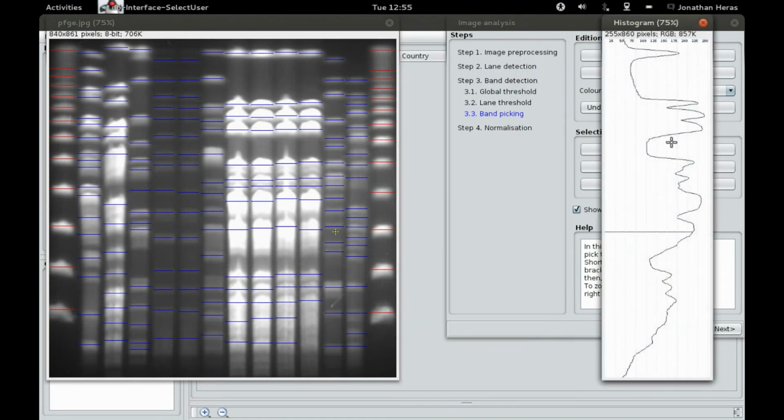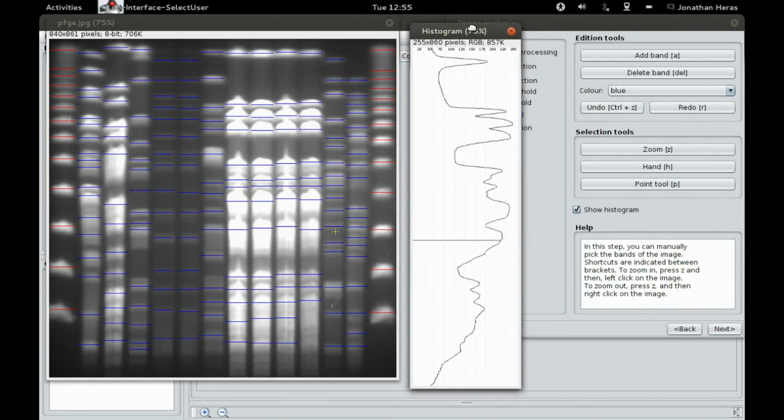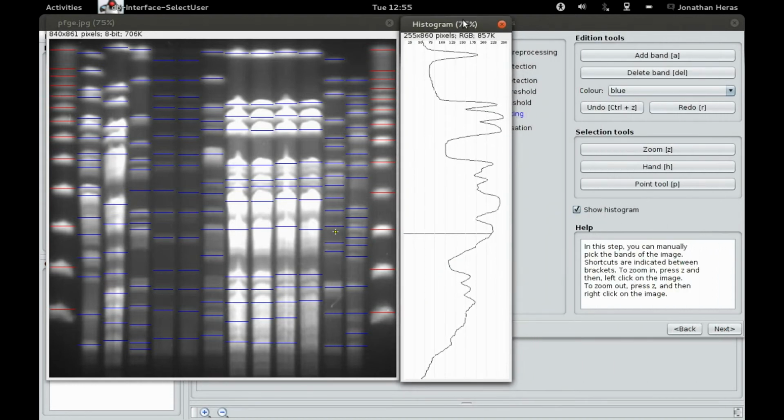If we press another region, the histogram of that region is selected. If we press in any point of the histogram, an intermediary band is selected. To add this band, we just press the Add button.